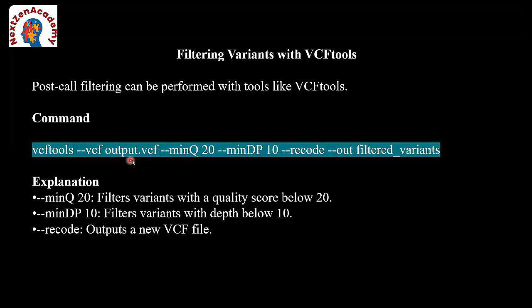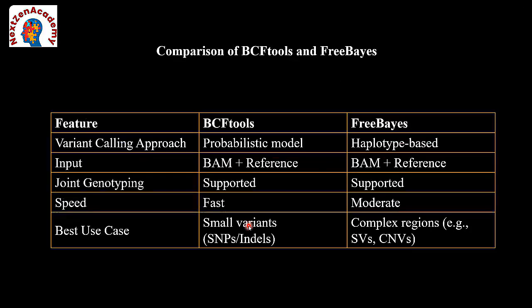So these are the titles you need to give, and then you need to convert that filtered GVCF into a variant format.